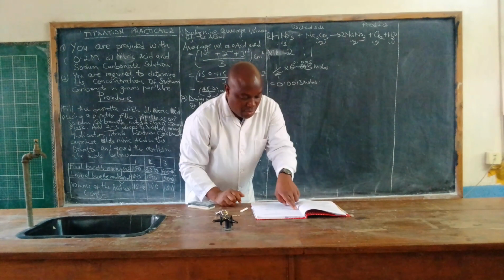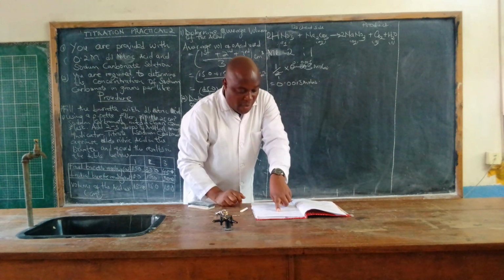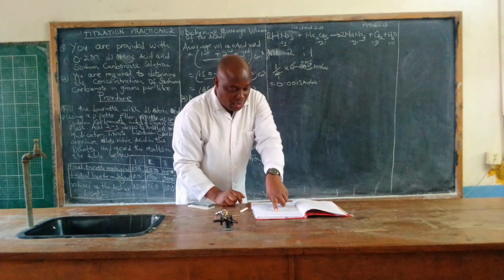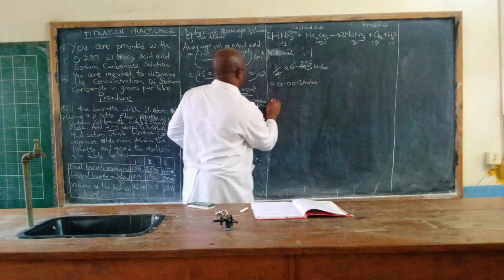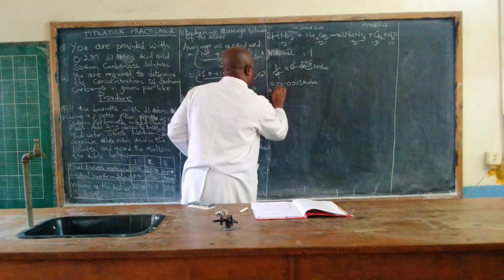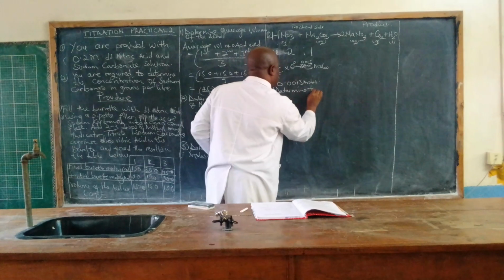Next, we have been told to determine the molarity of sodium carbonate. This is number 4. Determine the molarity.